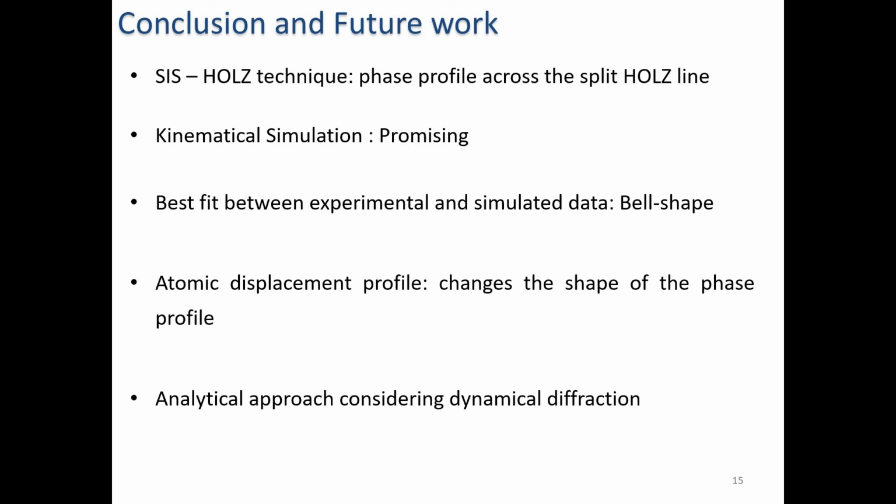In order to modify this method, I'm interested to apply the same approach considering the dynamical diffraction effect. Also, in the presented analytical approach, the atomic displacement is symmetric with respect to the center of the specimen. Considering asymmetric atomic displacement profile could be quite beneficial in further development of this work.